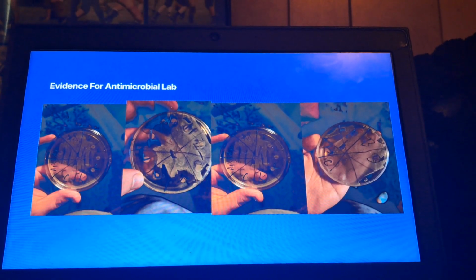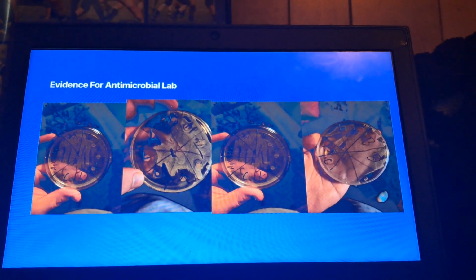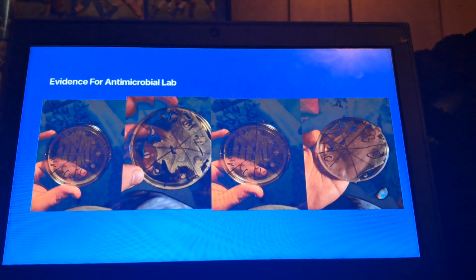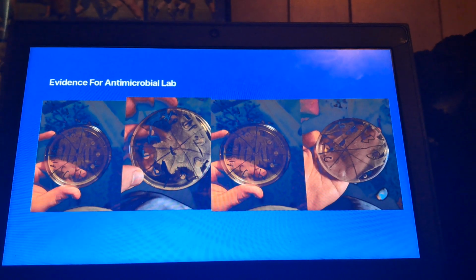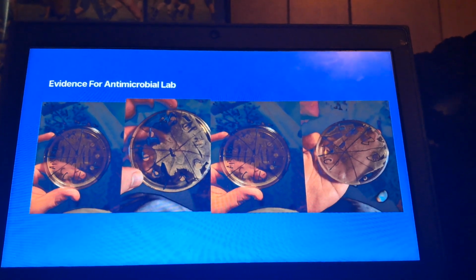The apples, it appeared to be, from my experiment, the most susceptible to the bacteria, getting covered in every single plate that we tested for. And then followed closely after by bananas, which were covered second most out of all of them. But lemons, definitely, every single one had a defensive ring around it. If a large amount of lemon juice was on the plate with it, it completely killed all the bacteria around it.